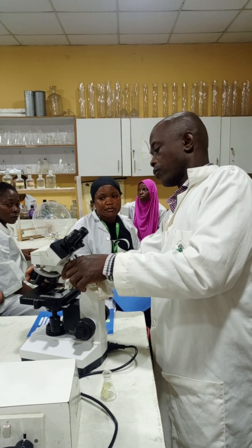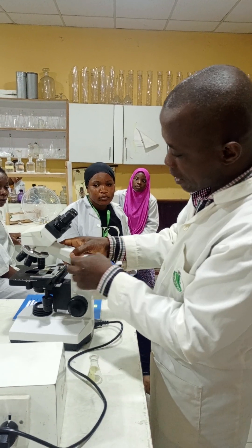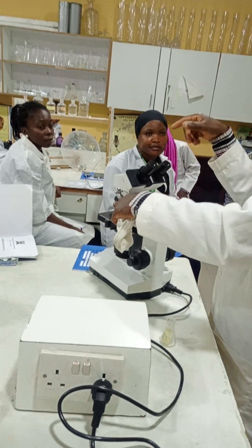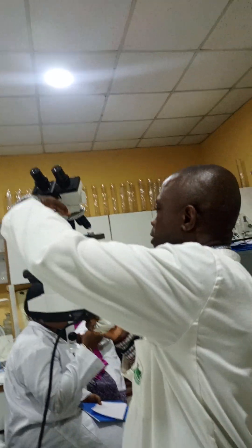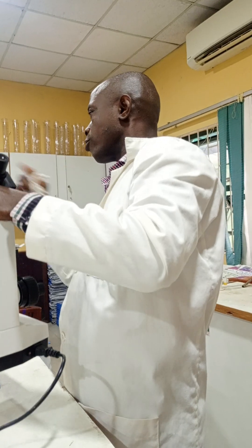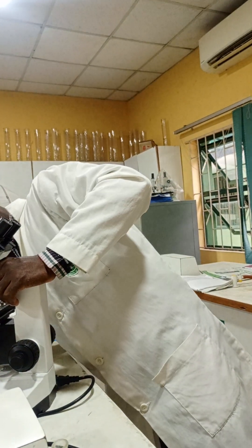Inside the objective lens, there are also lenses that magnify the image. Any objective lens that faces your specimen — check the color band on it. A red band is times 4. A yellow band is times 10. A blue or green band is times 40. The one that looks creamy or white is times 100. Those are the four objective lenses.